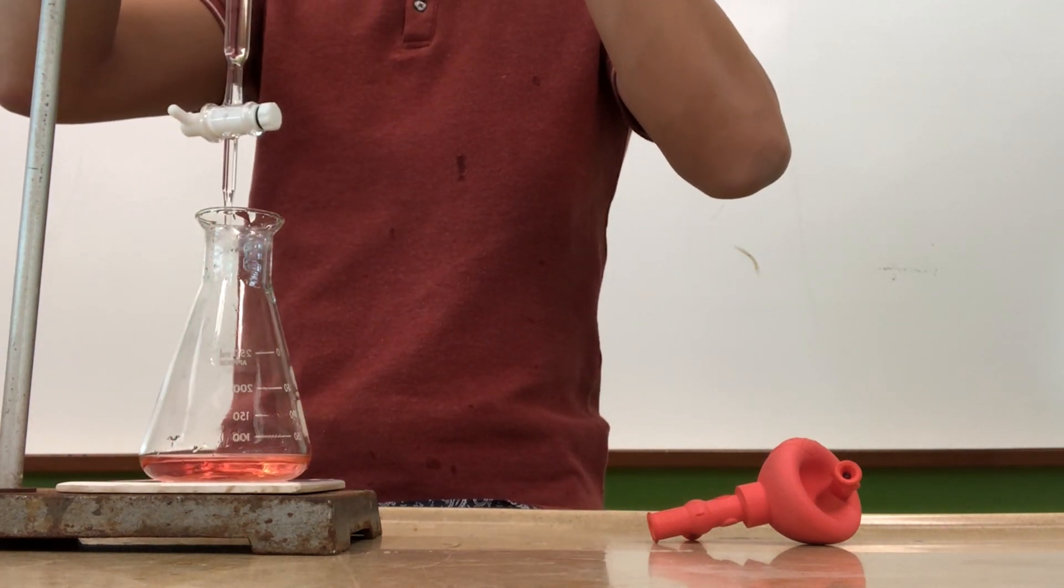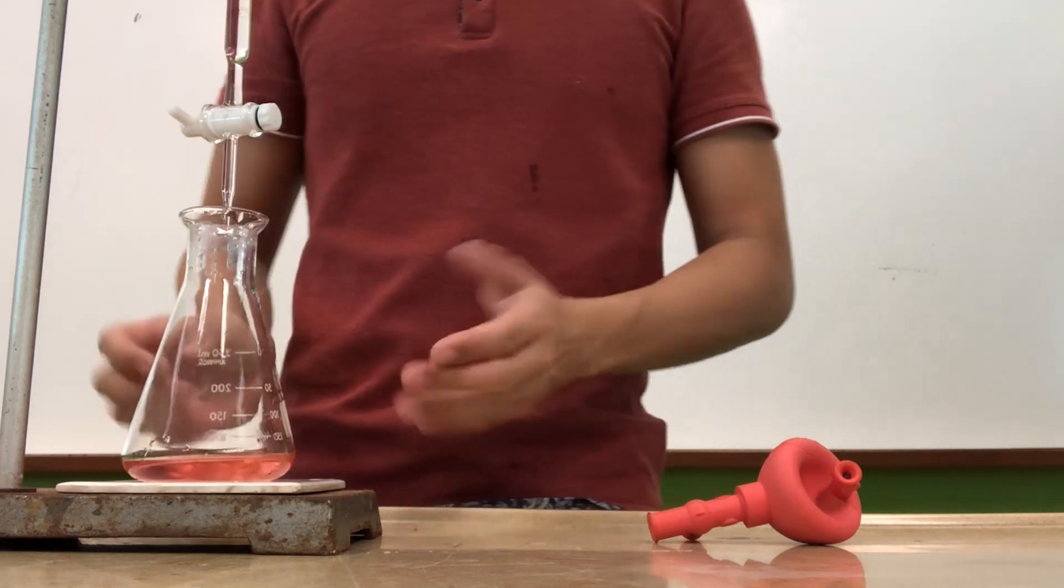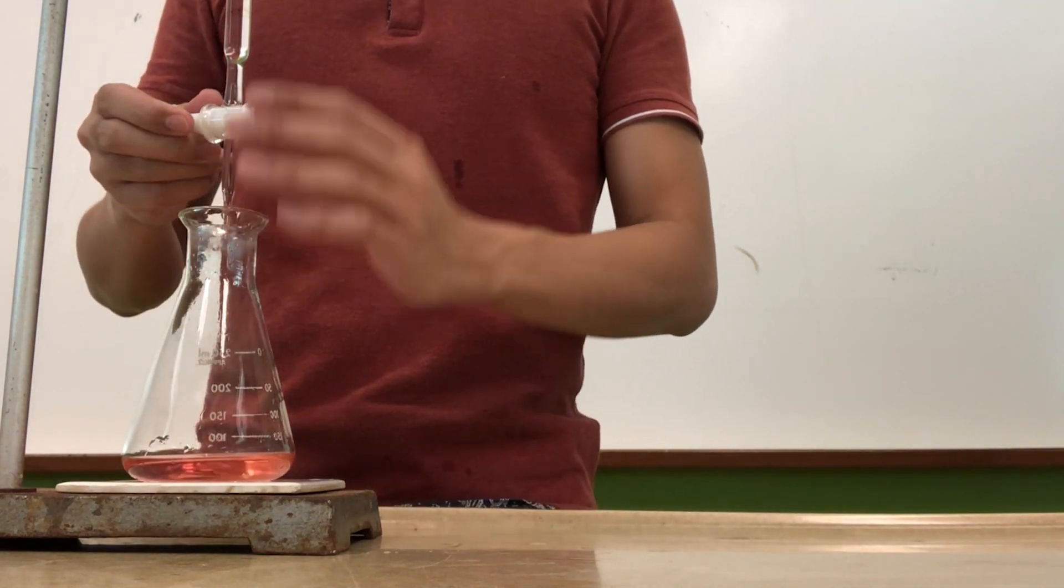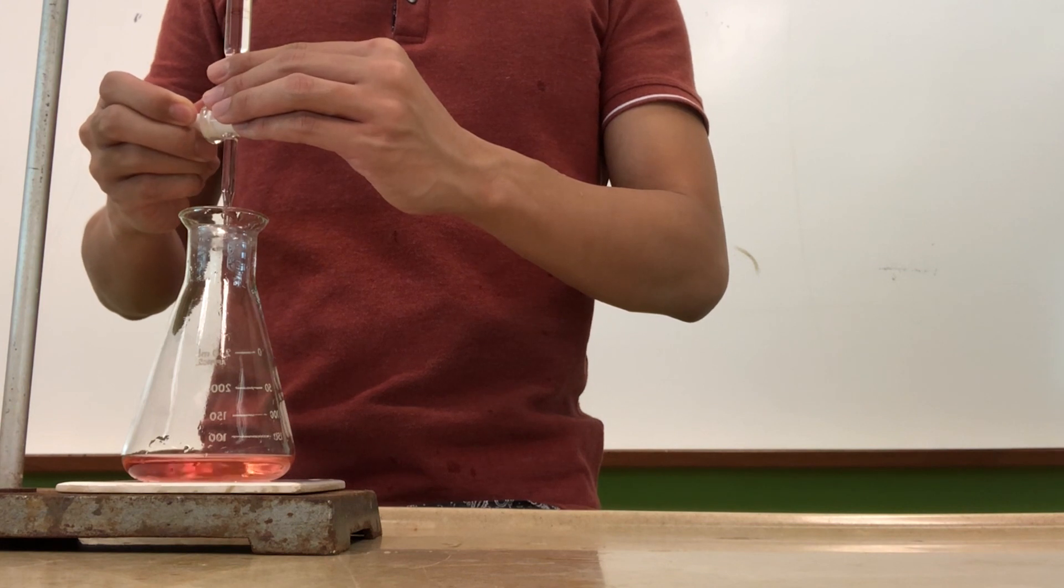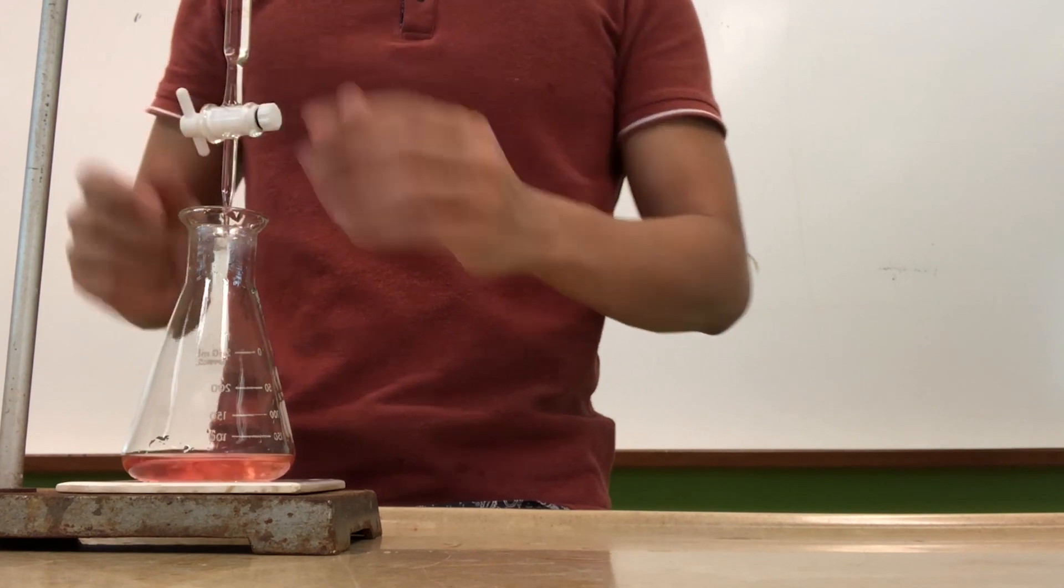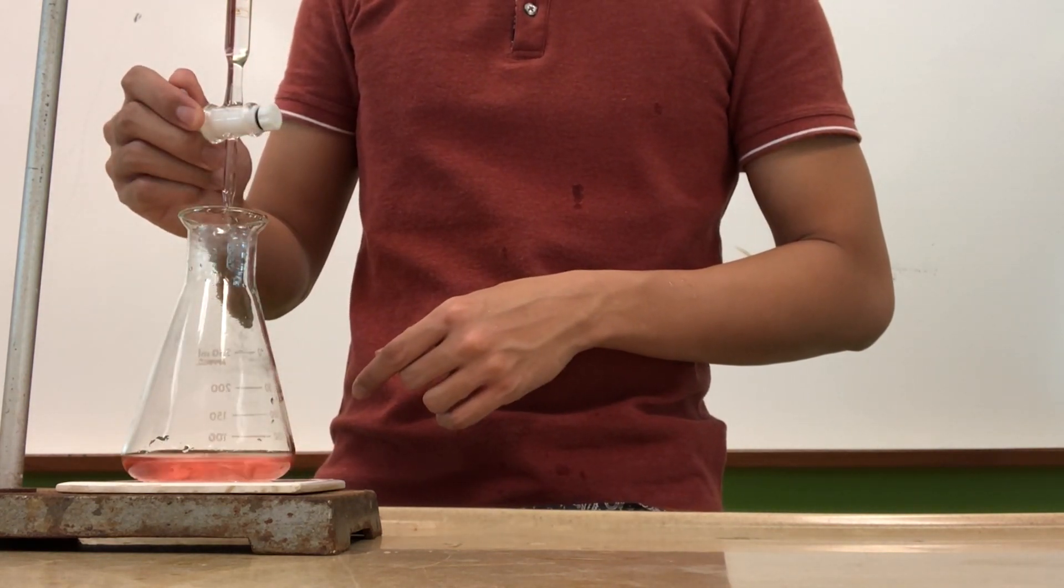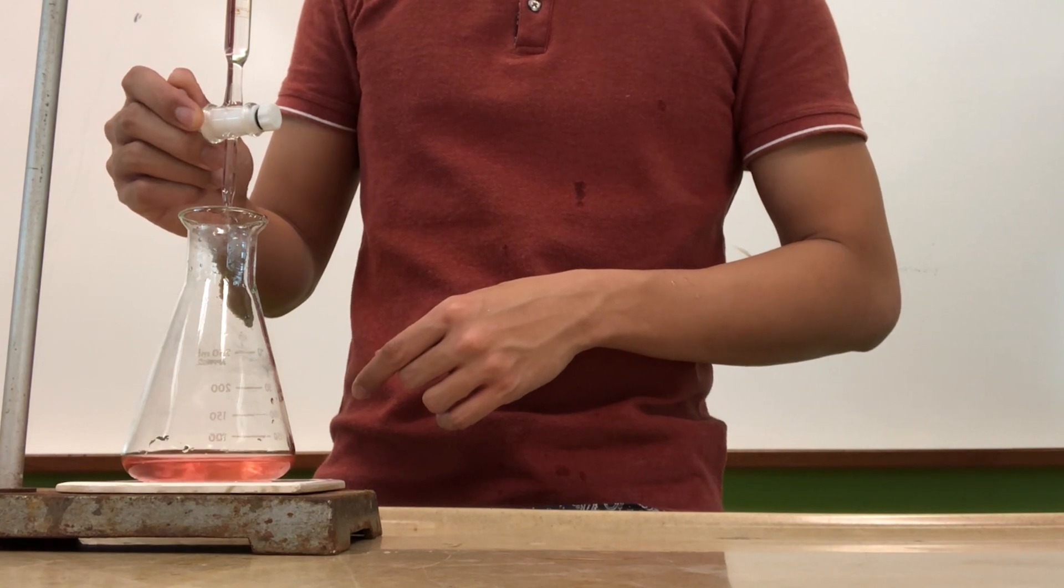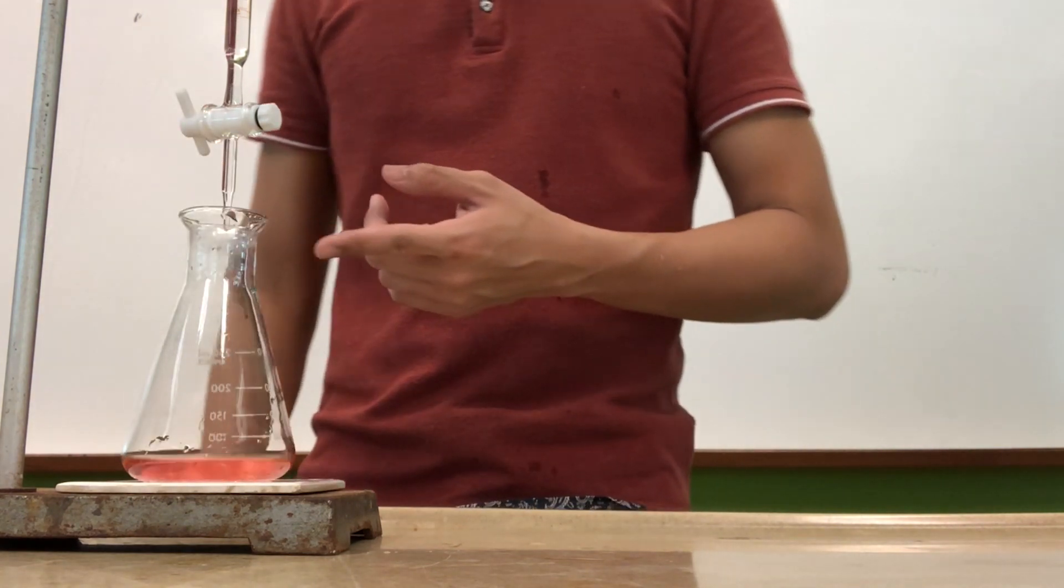Now let's set up the burette to make sure that we can dispense the solution directly into the conical flask. As mentioned previously, let's try to find out how much should we turn the knob in order to achieve the dropwise addition first. Remember the angle that you are turning the knob to, so that later on when you need to turn it to dropwise, you can achieve this angle as soon as possible.